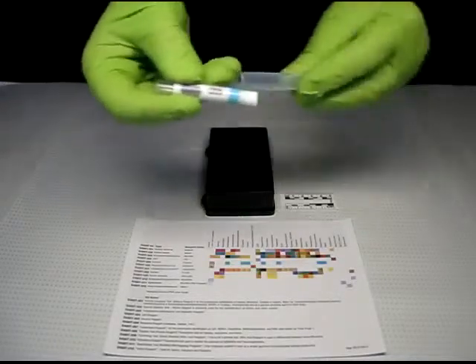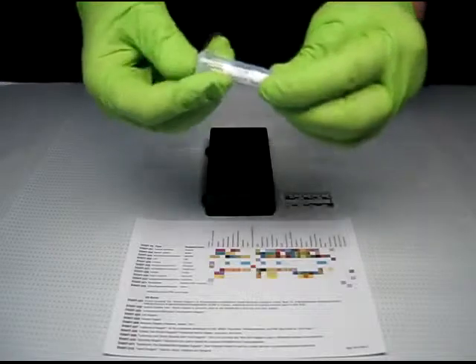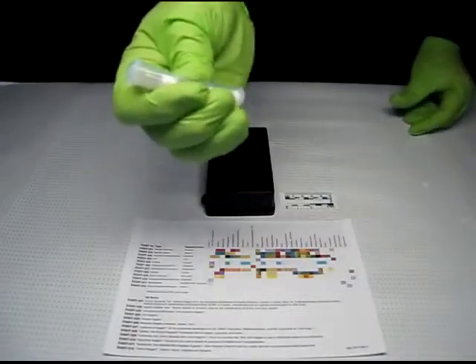The liquid turns the sampler tip light purple as the tip is wetted. This alone does not indicate a positive result.